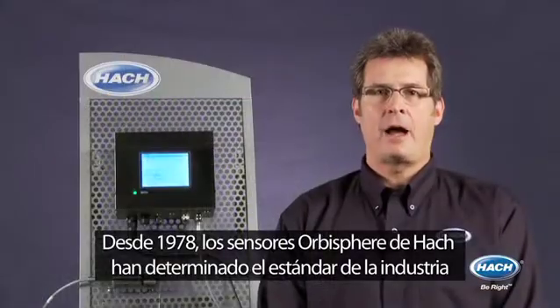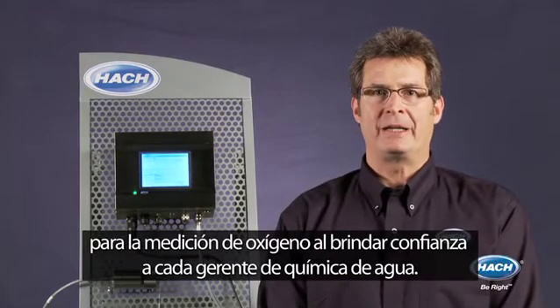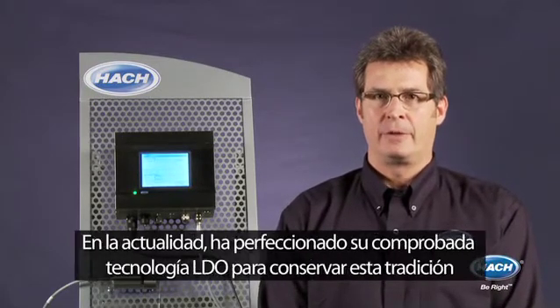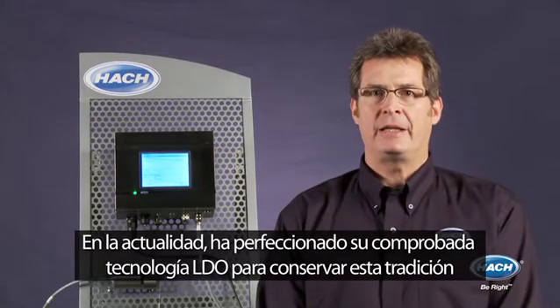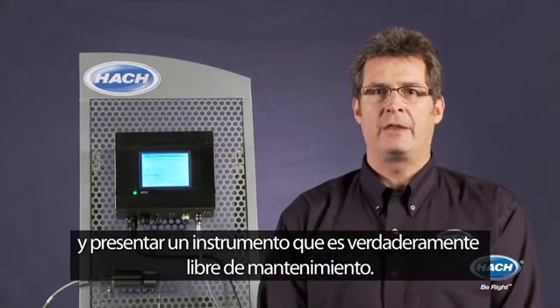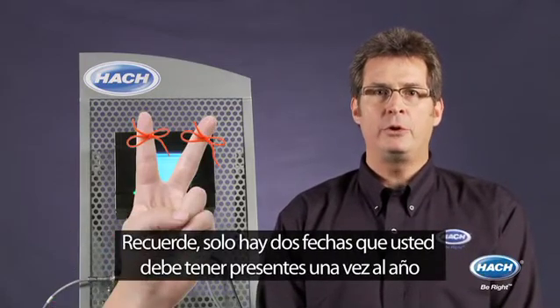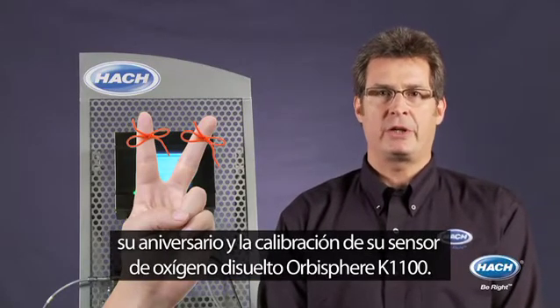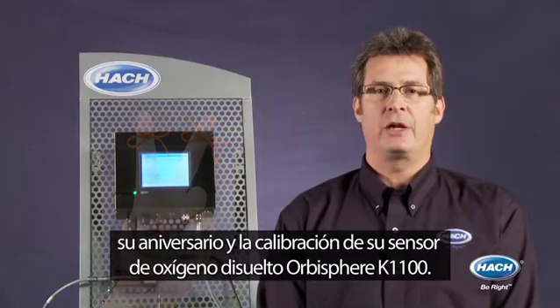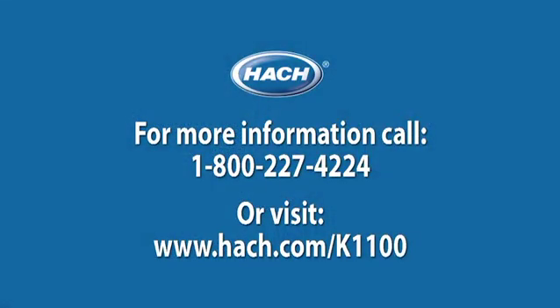Since 1978, Hach Orbisphere sensors have set the industry standard for oxygen measurement by delivering confidence to every water chemistry manager. Today, we have perfected our proven LDO technology to maintain this tradition and deliver an instrument that is truly maintenance-free. Remember, there are only two dates you have to remember once a year: your anniversary and the calibration of your Orbisphere K1100 dissolved oxygen sensor. For more information on the Hach Orbisphere K1100, contact your local sales representative.